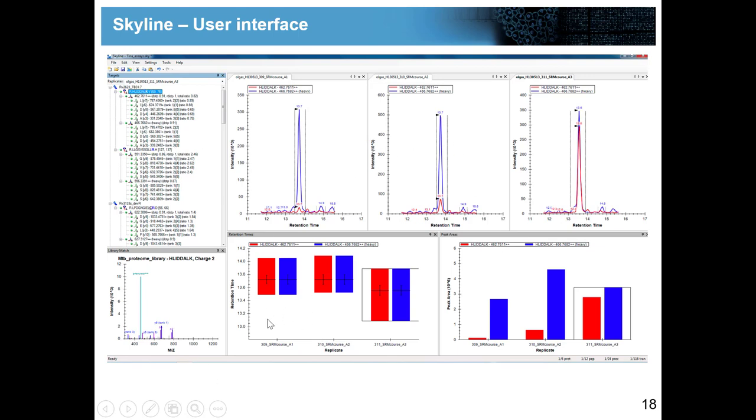This target window is always going from protein, peptide, precursor to all the transitions. What's also important to understand is depending on what you highlight here, you will change the views of all the other windows. If you highlight the protein up here you will see protein information on all the other windows. If you highlight a peptide you will see peptide information. If you highlight the precursor you will see the precursor information.